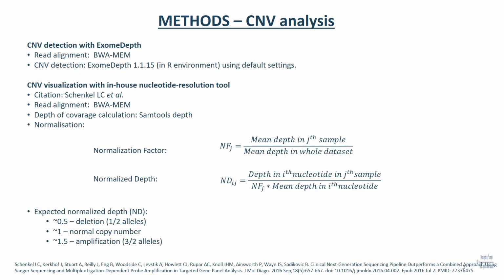We aligned reads using BWA-MEM and performed CNV detection using ExomeDepth with default settings. Additionally, we implemented our own tool for CNV visualization at single nucleotide resolution. Here, reads also were aligned using BWA-MEM. The calculation of depth of coverage was performed with samtools depth.